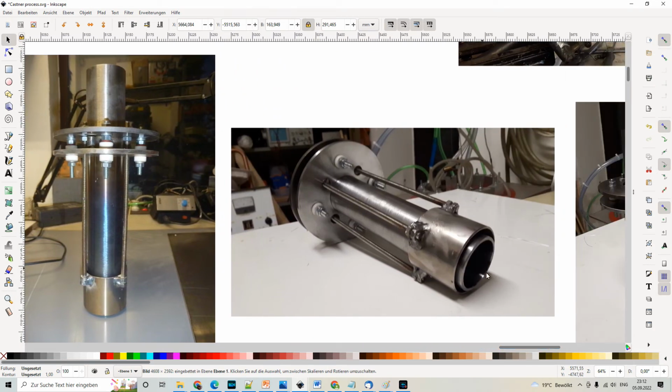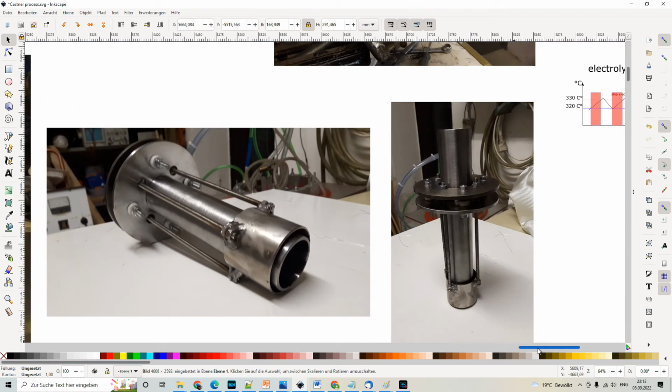That's the bottom view of the thing, and basically you see that the anode here is not connected with this steel plate. This steel plate will be put on the chamber, so it's insulated with some insulators and not having a connection. That's also very important, otherwise the entire cell will start to act as an anode, and we don't want that.